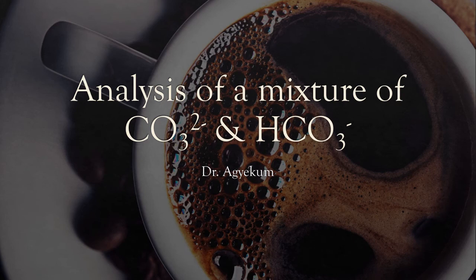This is the supplemental video for the analysis of a mixture of sodium carbonate and sodium bicarbonate lab. Let's begin our discussions by looking at the components of our mixture.